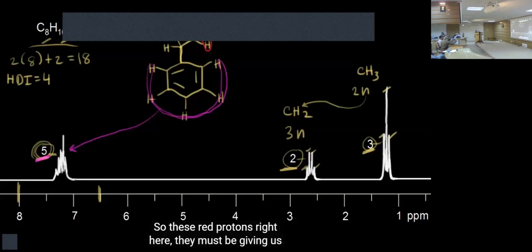For example, just consider you do not know the structure and you have this simplest spectrum in front of you. When you see the triplet, then you immediately think there must be a CH2 next door to this triplet. And looking at the intensity, you know there are 3 protons.